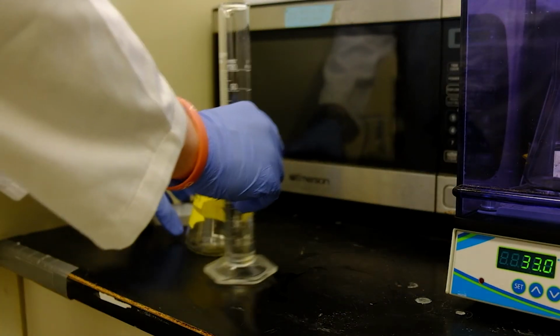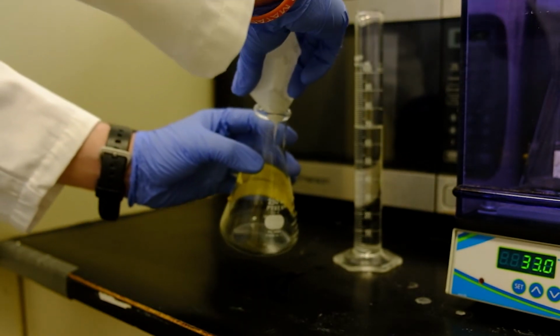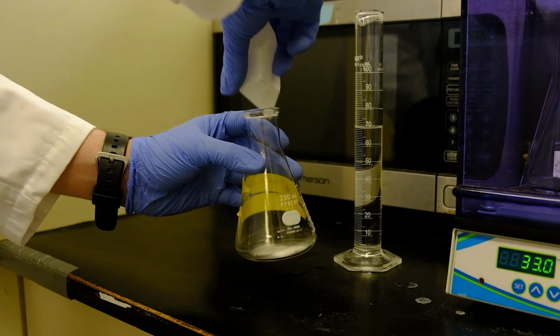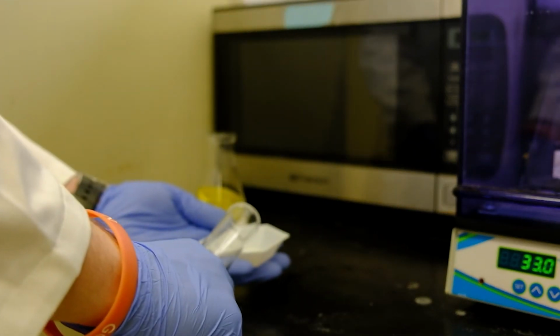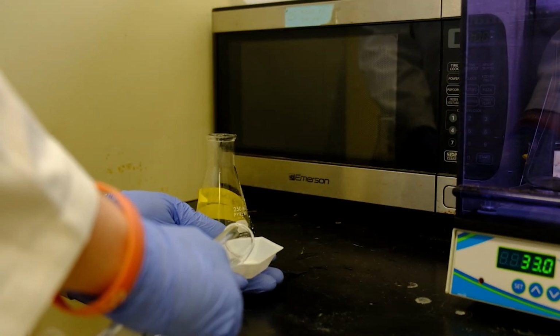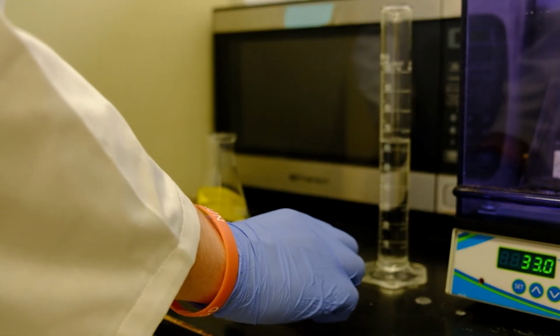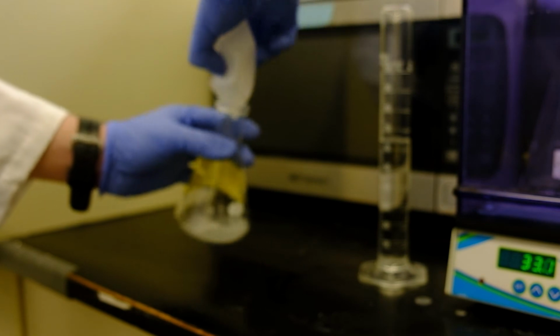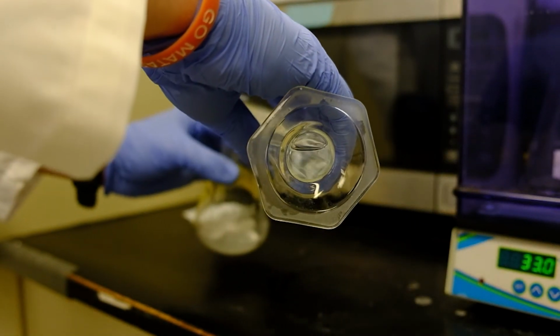Get a vessel that you're going to mix your gel in and add your agarose first. You can pour some buffer into your weighing dish to help get all of the agarose powder out. And put the rest of the TAE into your mixing vessel.